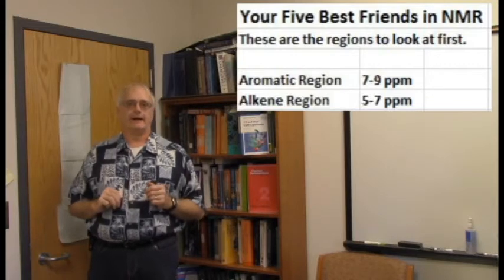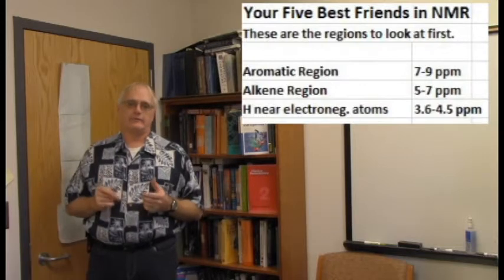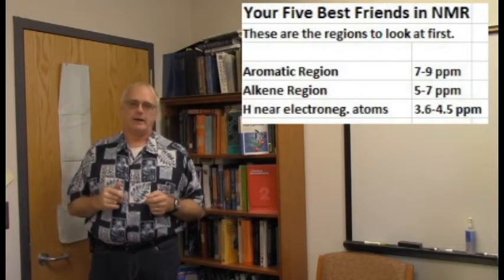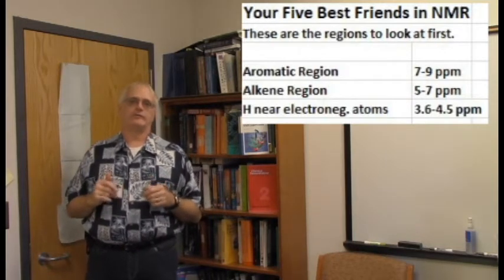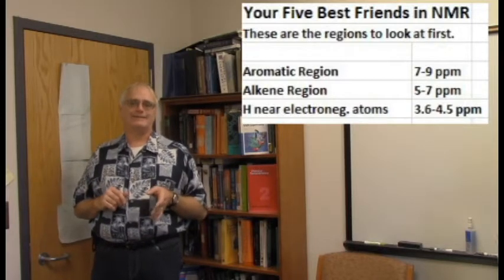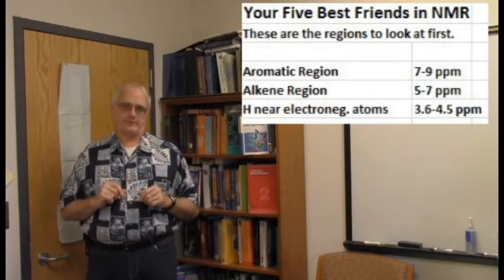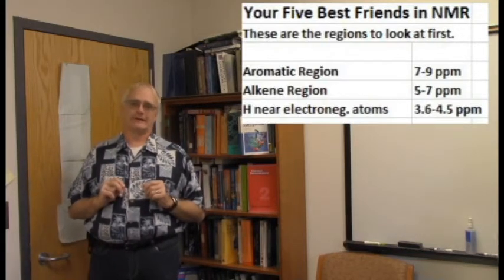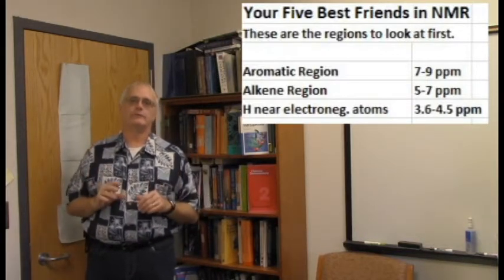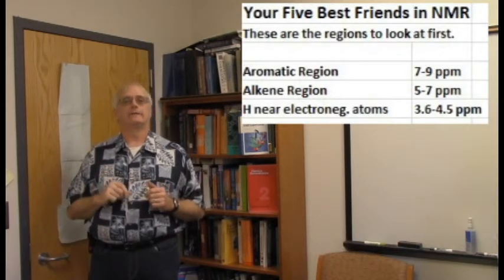Third best friend to look at, hydrogens near electronegative atoms. If you're a hydrogen on a carbon that is attached to an oxygen or to a nitrogen, say, a hydrogen found in an ester or an ether or an alcohol or an amine or an amide, something like that. The area around 4 ppm is very common for hydrogens like these, and it can vary from like 3.6 up to 4.5, somewhere in there. But the zone around 4 tends to be hydrogens near electronegative atoms.